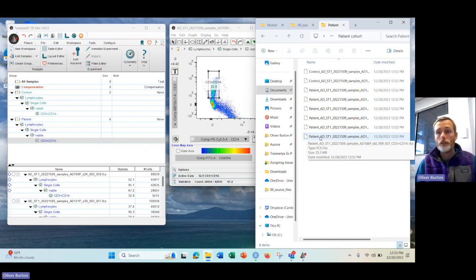And that's all for this section. There's an optional section in the next step if you want to look at how to do transformation in FlowJo. Otherwise, the transformation will be applied automatically in FlowCytoScript, and really you can now just go straight to the FlowCytoScript workflow. And that's all.